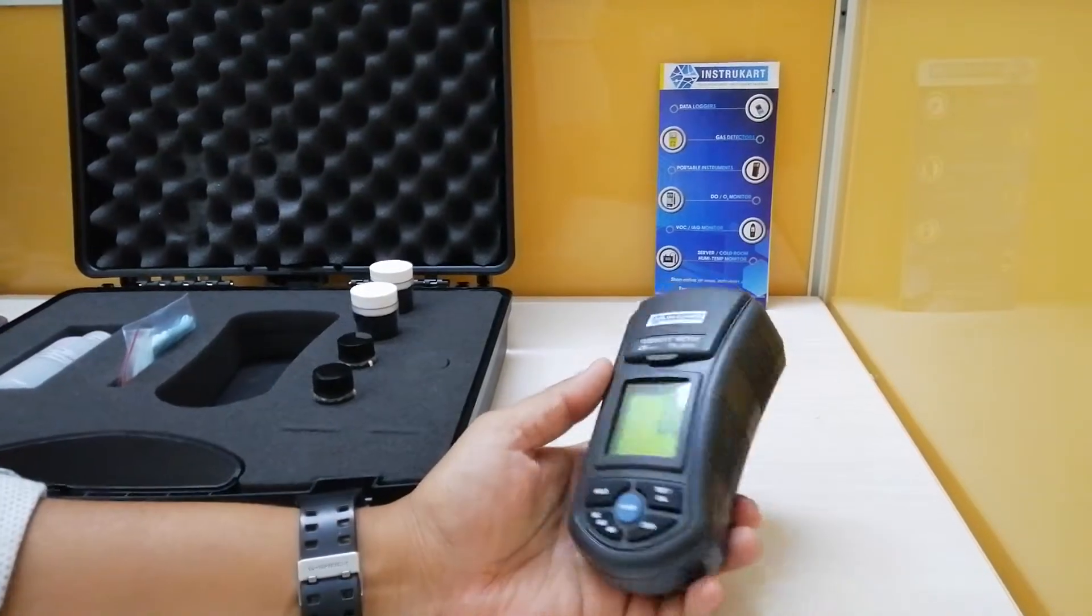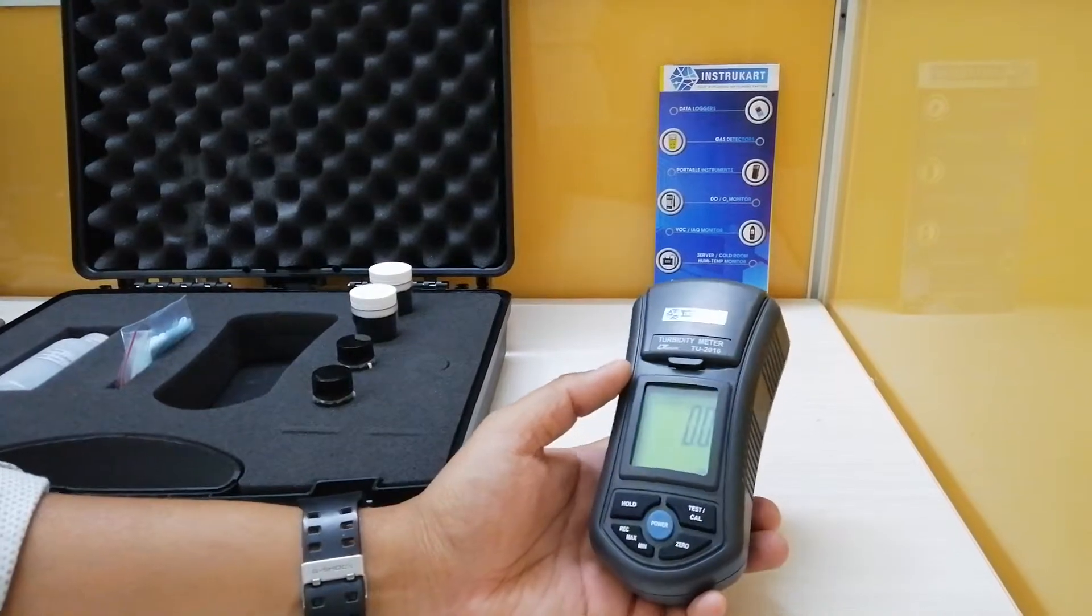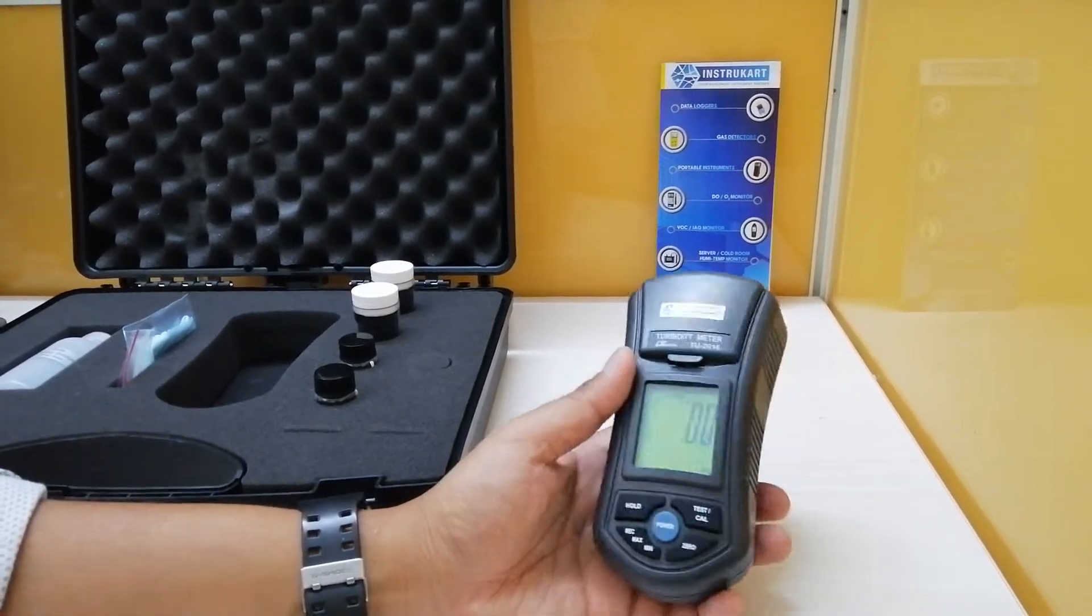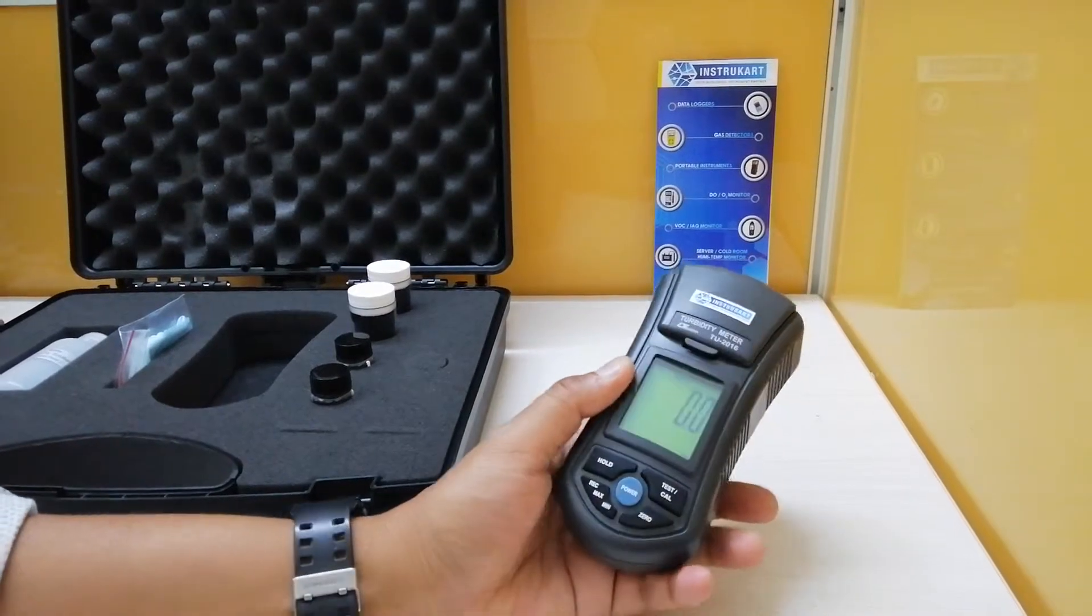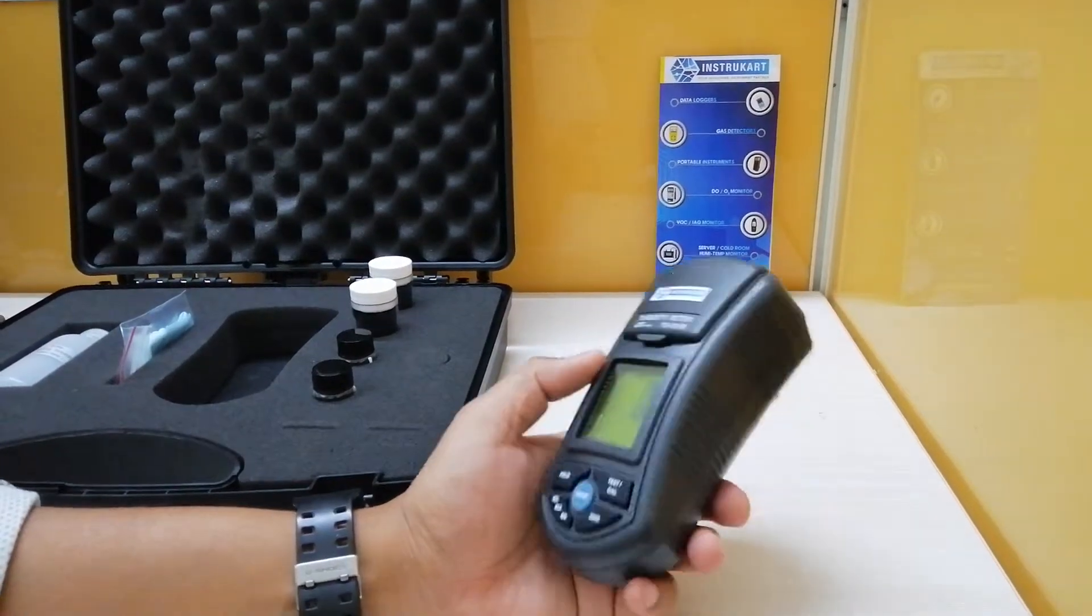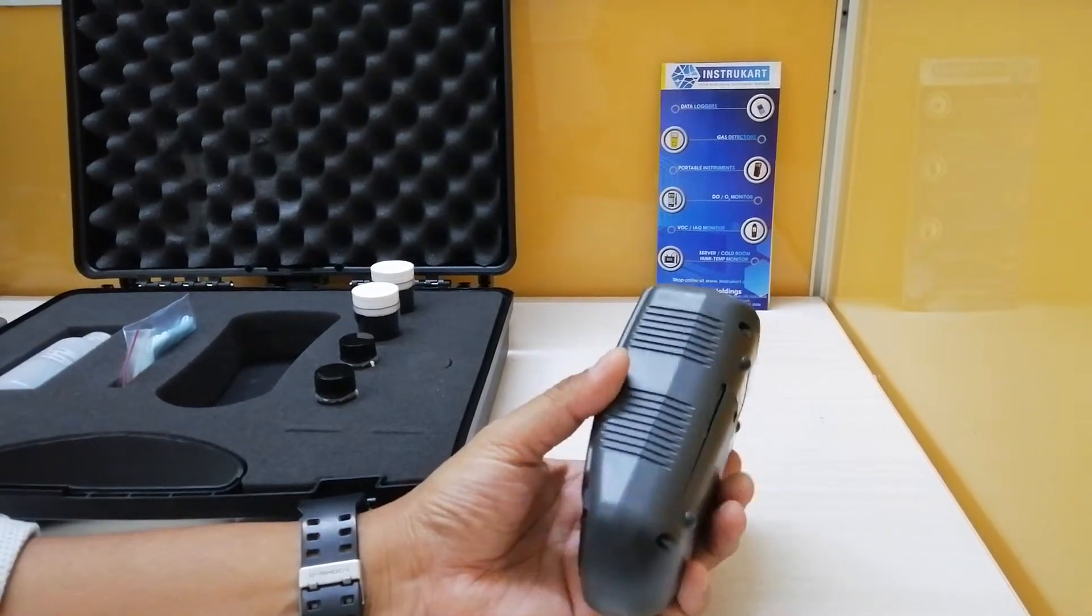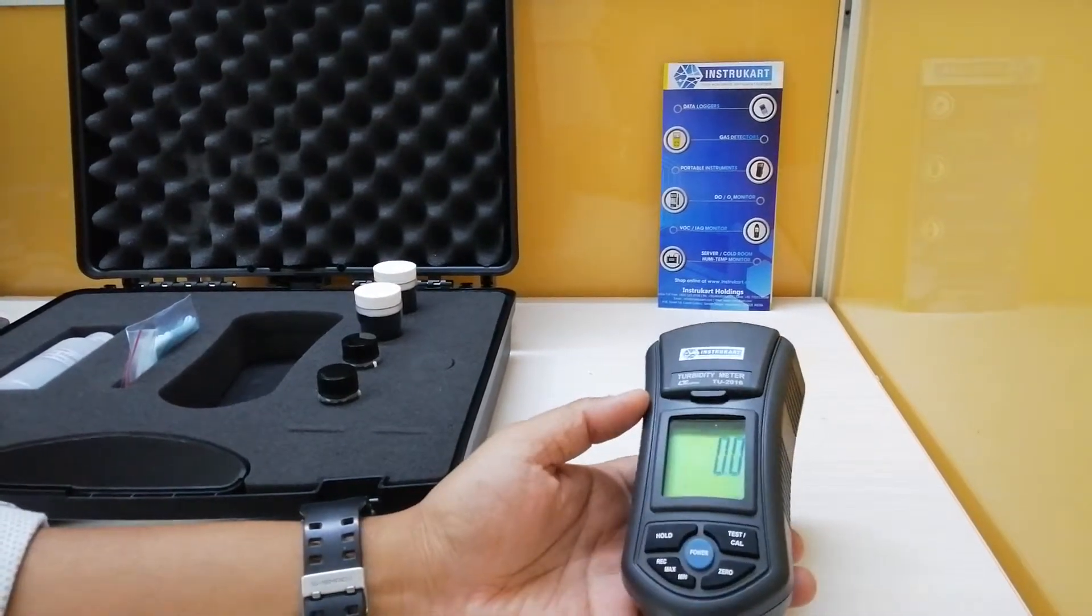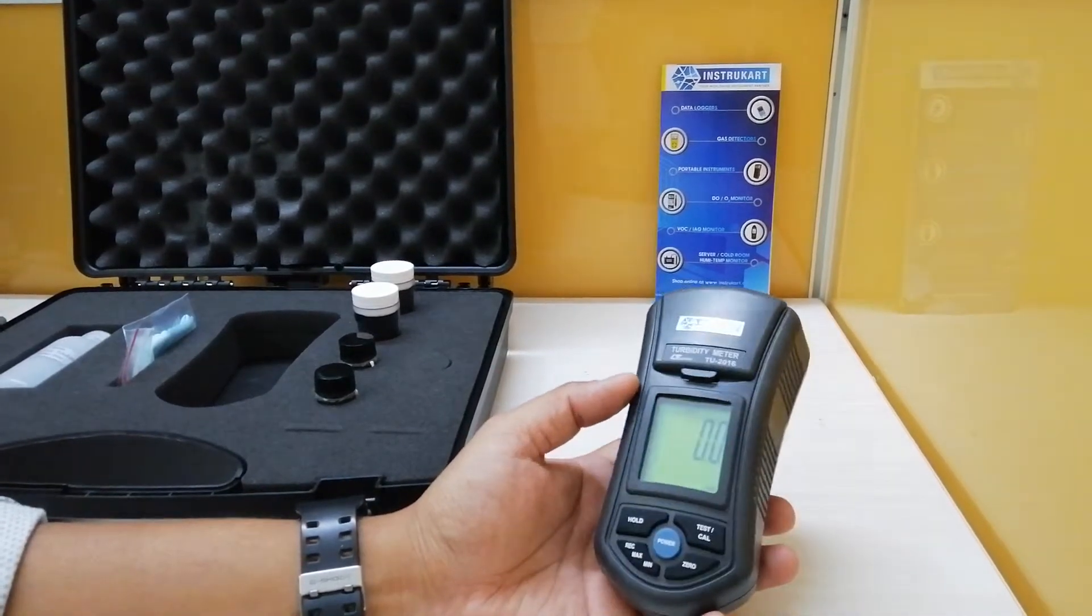Or 0.5 NTU plus or minus, whichever is greater. The light source is LED which is 850 NM and the detector is the photo diode. It meets the standard ISO 7027 for the testing procedure and the response time for this meter is less than 10 seconds.